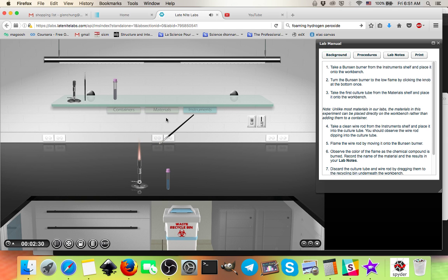I just want you to get some extra conceptual practice here in a nice, safe way, because I'm asking you to do this at home. I don't want you to play with fire at home, so we'll do it in this virtual lab instead.